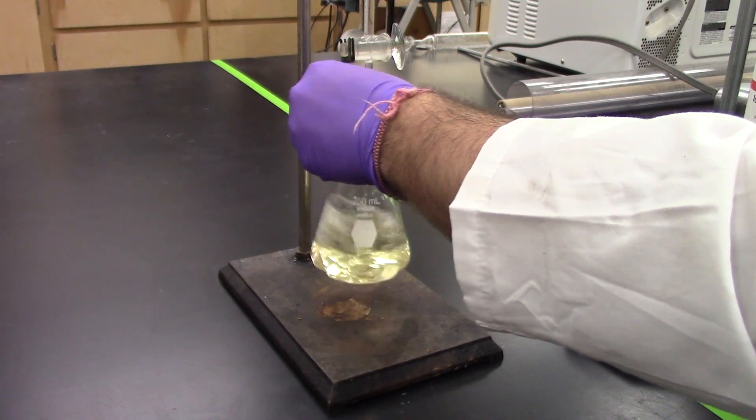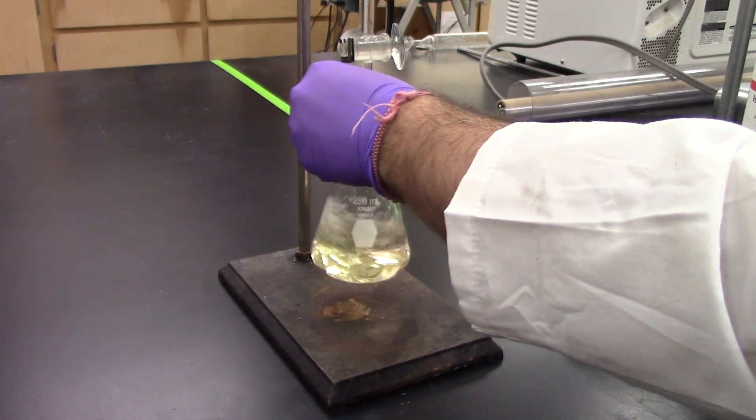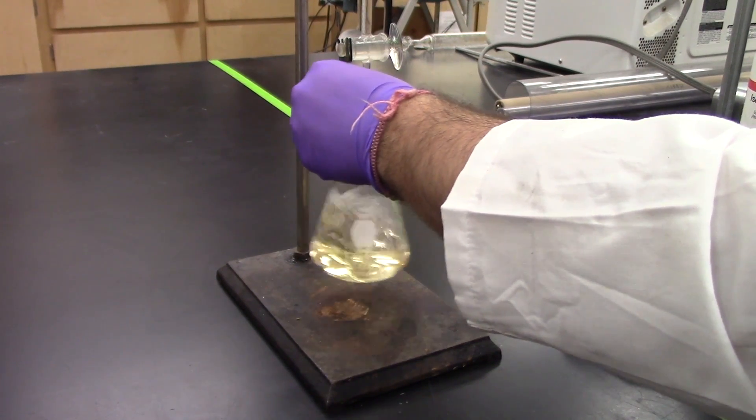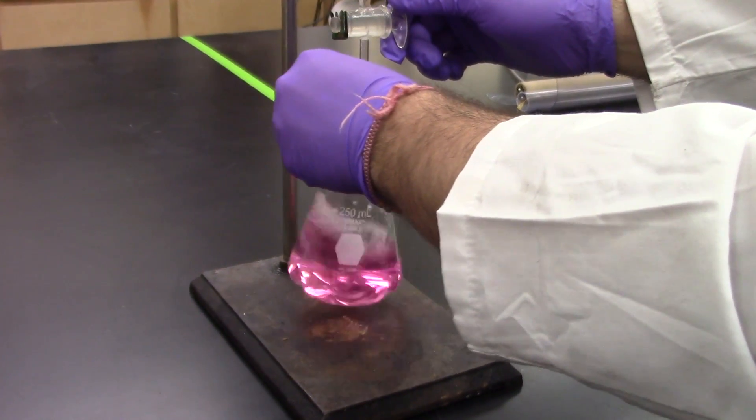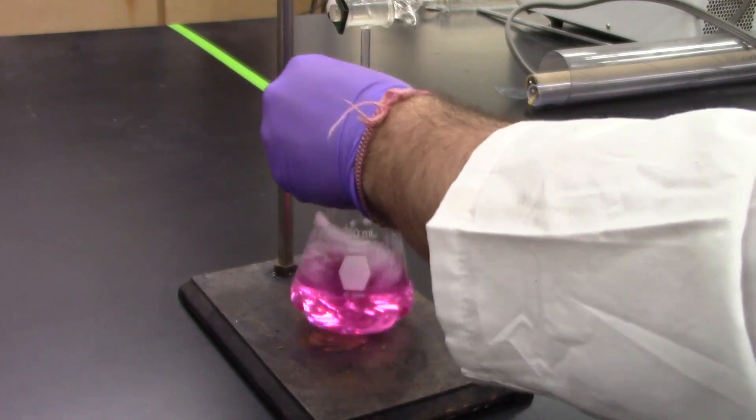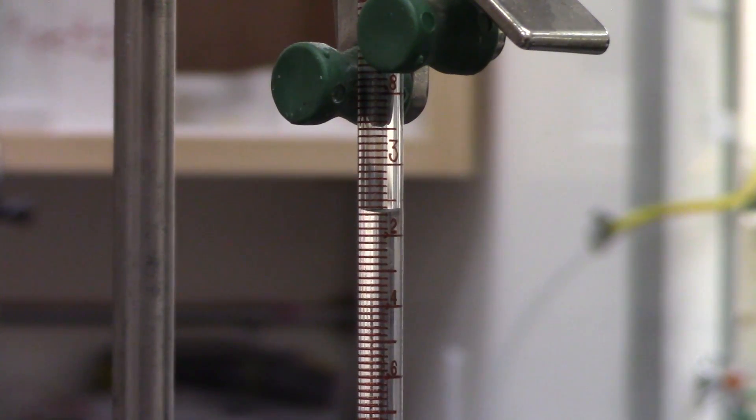Titrate while stirring with potassium hydroxide titrant to the endpoint, which is a definite color change to orange or green-brown color that persists for at least 15 seconds. Record the milliliters of titrant consumed.